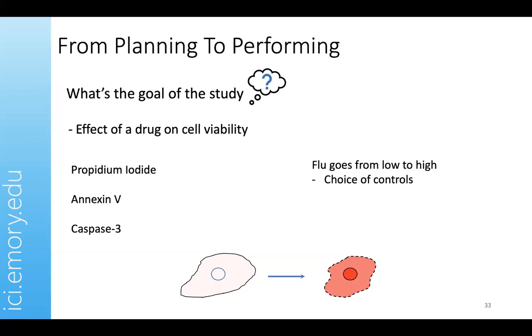Hence, it's important to select a control, for example, a positive control, which will help you decide your imaging parameters to figure out what your highs and lows will be. And your images won't be saturated, and you will be using an entire dynamic range available in your image. Okay, so again, one more big word, dynamic range, and we will be talking about that too later.